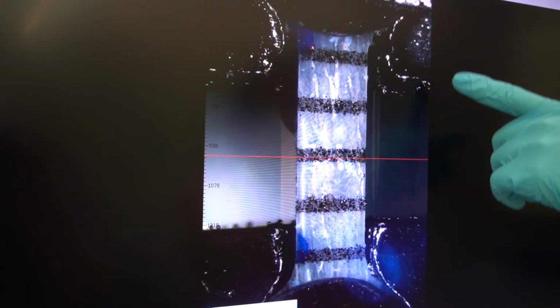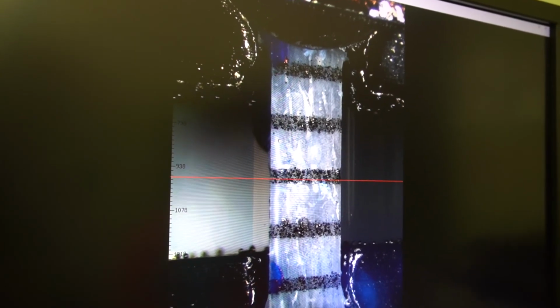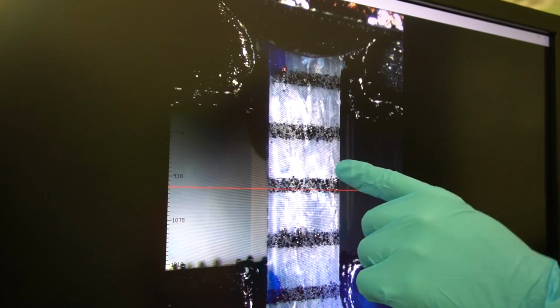Here you see now the finished video, and I will play it faster. So you see now here the movement up and down also of the sample. And when we come to this point, you see here that we have a so-called whitening effect in this region and in that region. So there apparently damage accumulates, and this is the reason why light refraction is changed. And when we unload again, this effect is diminished because the cracks close. But when we load again, you see now that here we have these regions which accumulate lots of damage.